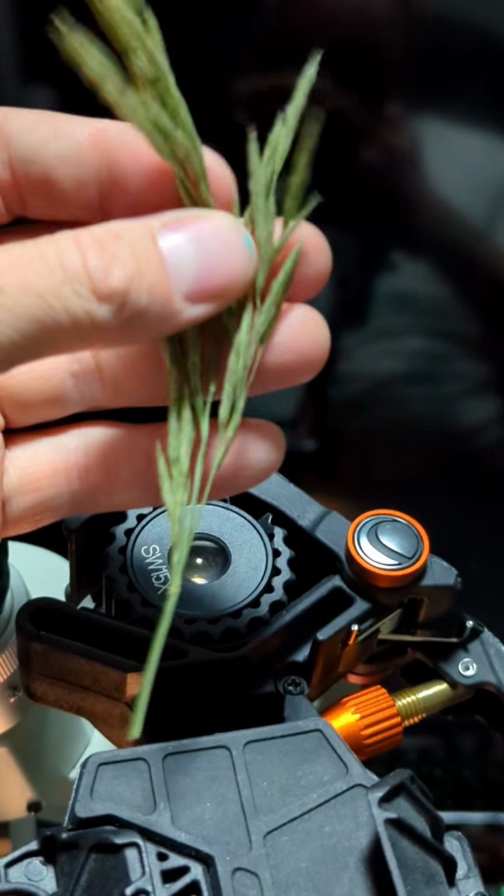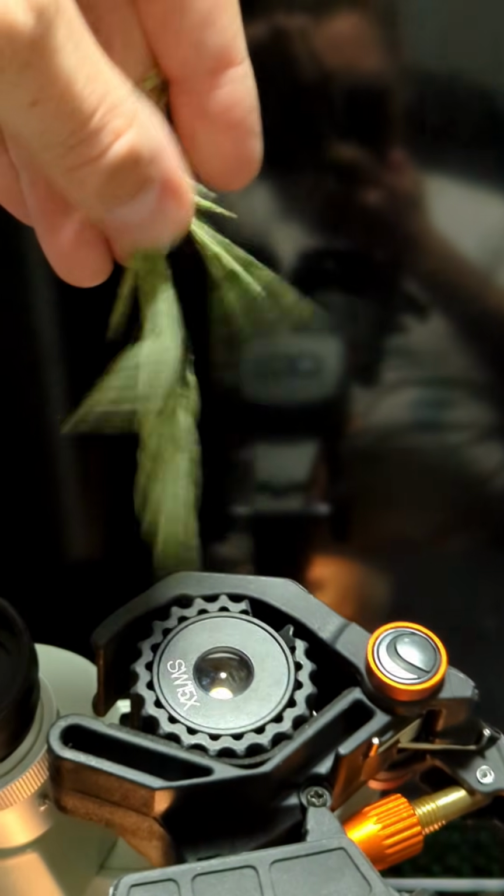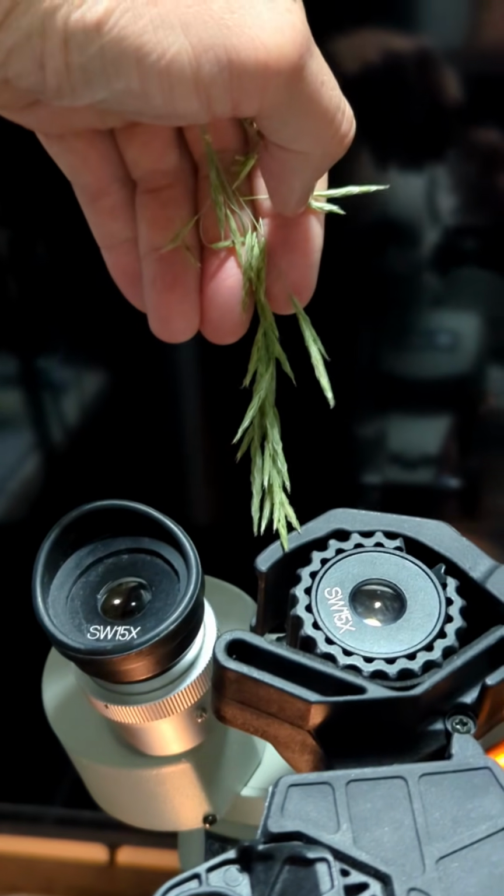Kind of hard to see, but I think it's a little crazy. So, like, I think of it as, like, it's panicking. No, never mind. Yeah, it's hard to split it open. But anyways, kind of like that. So it's like all over the place, but it's a very specific kind of all over the place.